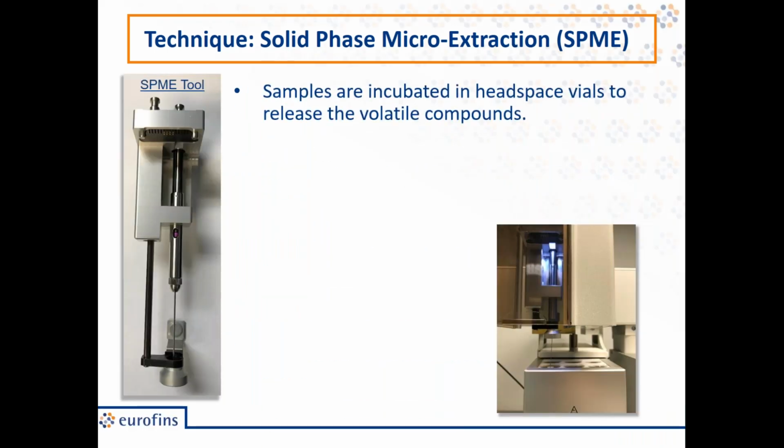So in brief, for SPME, samples are incubated in gas-tight headspace vials in order to release volatile compounds. And by tailoring the time and temperature of this incubation, we can target more volatile compounds using lower temperatures, or less volatile compounds using higher temperatures and longer times.